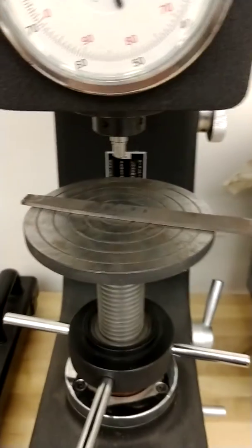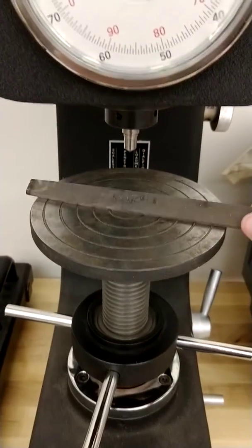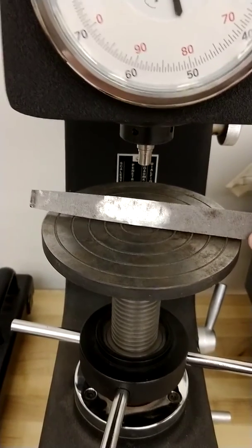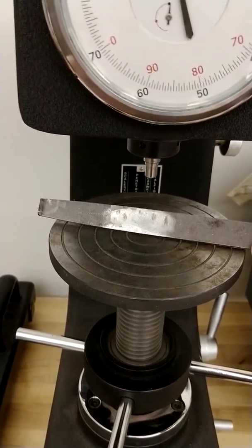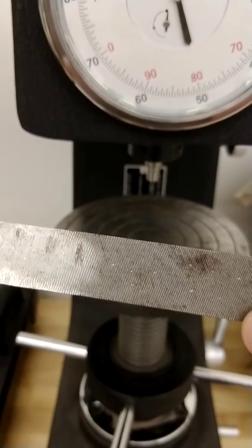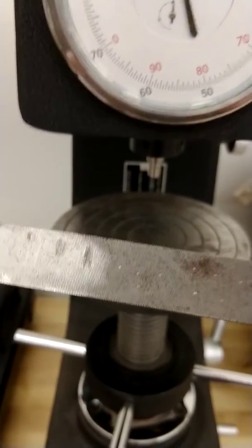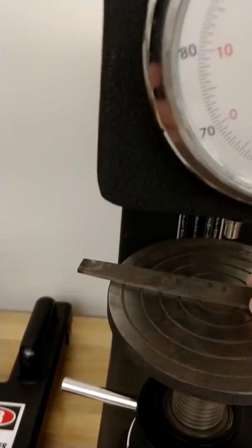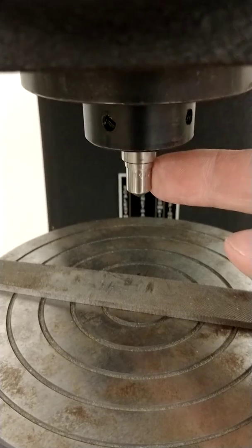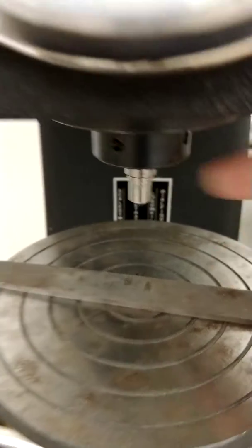Our part is already on the large flat platen. This is our file, and we've ground out an area in the middle of the file so we can get right down to the base metal to get the hardness test. Something with files is they always have these ridges in them — those are the cutting edges. You don't want to take a hardness test on those because you'll get a false reading. So we're going to place it underneath our diamond conical point indenter, which is what we have in the collar.